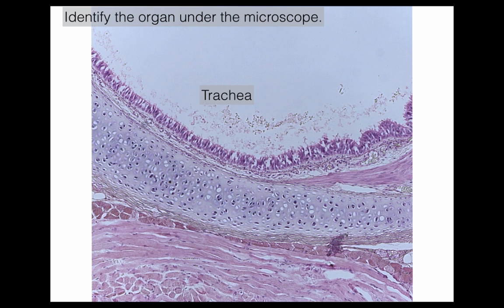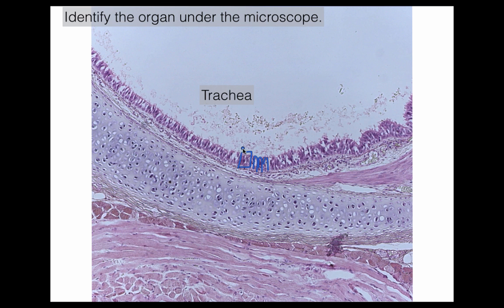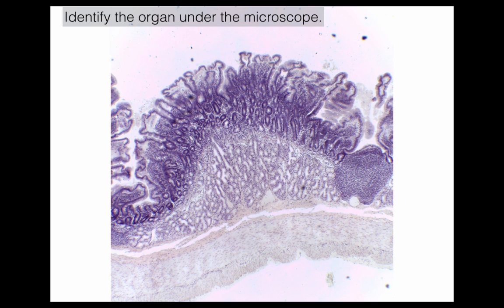This is the trachea, and there are two things that make it very obviously the trachea. The first is the pseudostratified ciliated columnar epithelium (PSCC) that you see here — it's got cilia on the top. The second, if you remember from Unit 1, is the hyaline cartilage here, which is the tracheal ring that supports the structure and keeps it open. Back here we have the trachealis muscle.